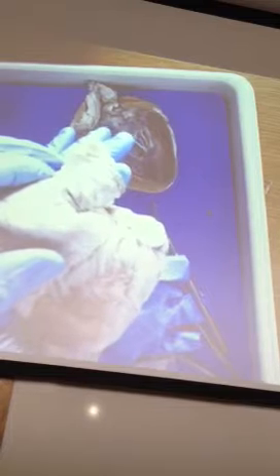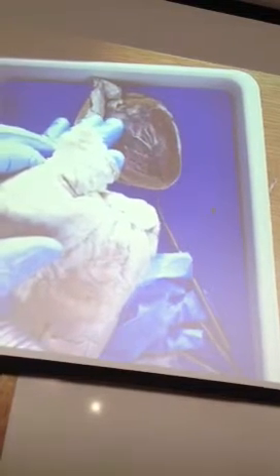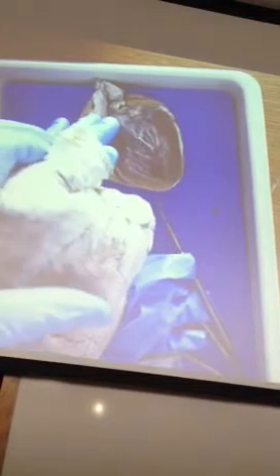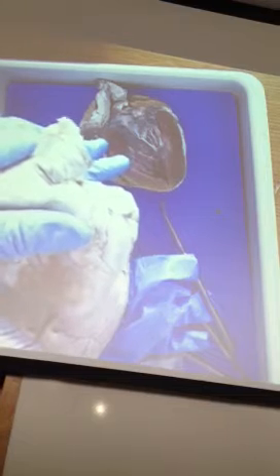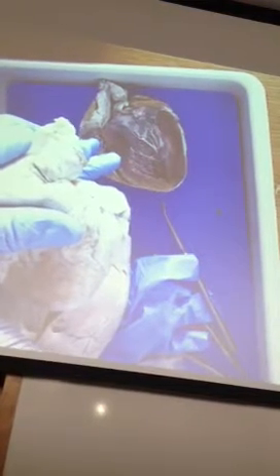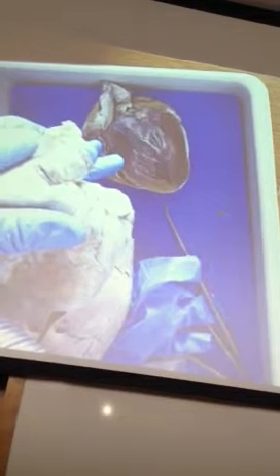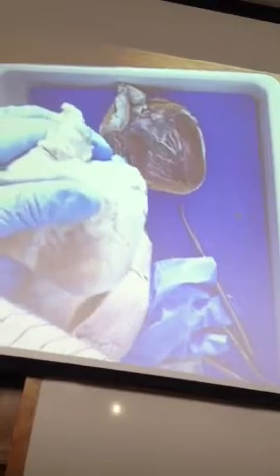So we're looking at the anterior surface of the heart. My finger's going out through the pulmonary trunk. Does everyone see that? So it moved from the right ventricle into the pulmonary trunk. It's going to go out. The blood's going to get into the lungs. It's going to pick up oxygen. And then where's it going to flow from there? Back into the heart via the what? What vessels? The pulmonary veins are going to take it back into what chamber?